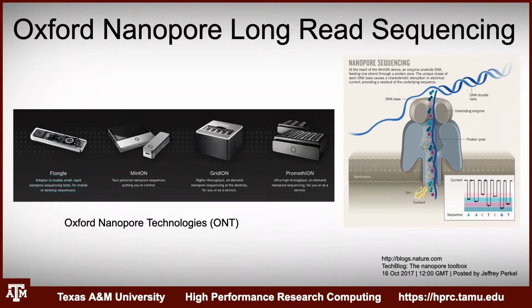But if you're doing something like sequencing a mammalian genome, or even a bird genome, where you're getting 1 billion base pairs up to 3 or 4 billion base pairs, something like that, then that becomes more of an issue with the error for this technology.